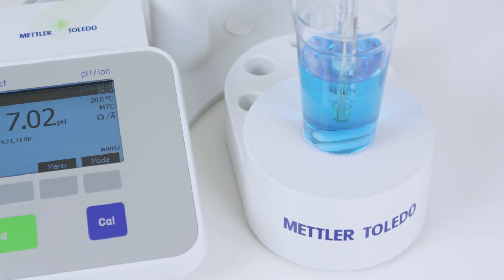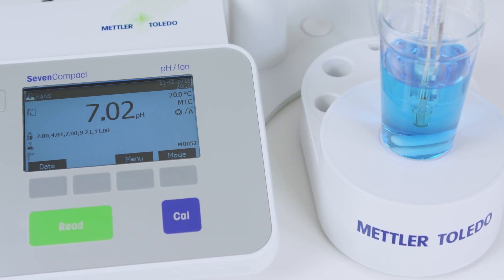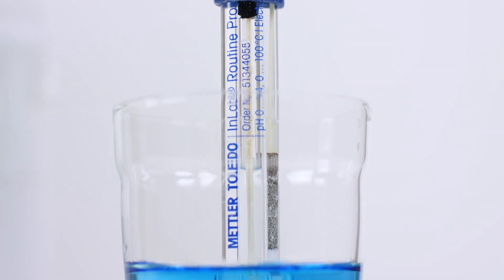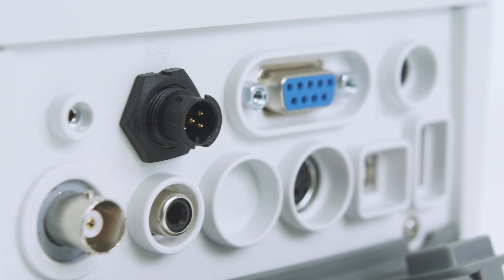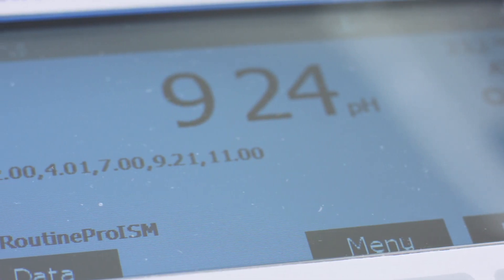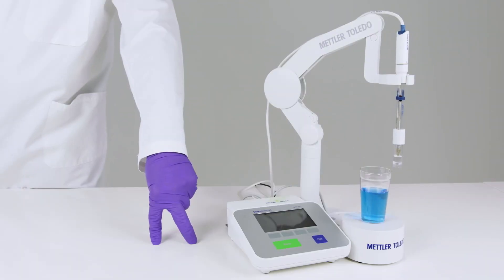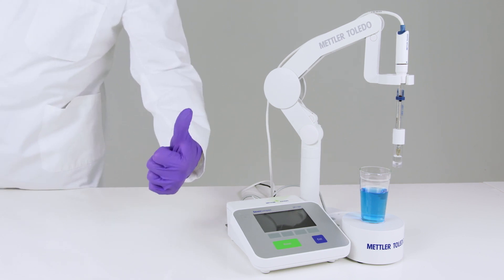So, the 7 Compact pH meter. It's really flexible and easy to use, combining precise electrochemical measurement technologies with flexibility, innovative design and ease of use. I think that's enough from corporate Hans. Why don't you go ahead and show them exactly how to use the meter.